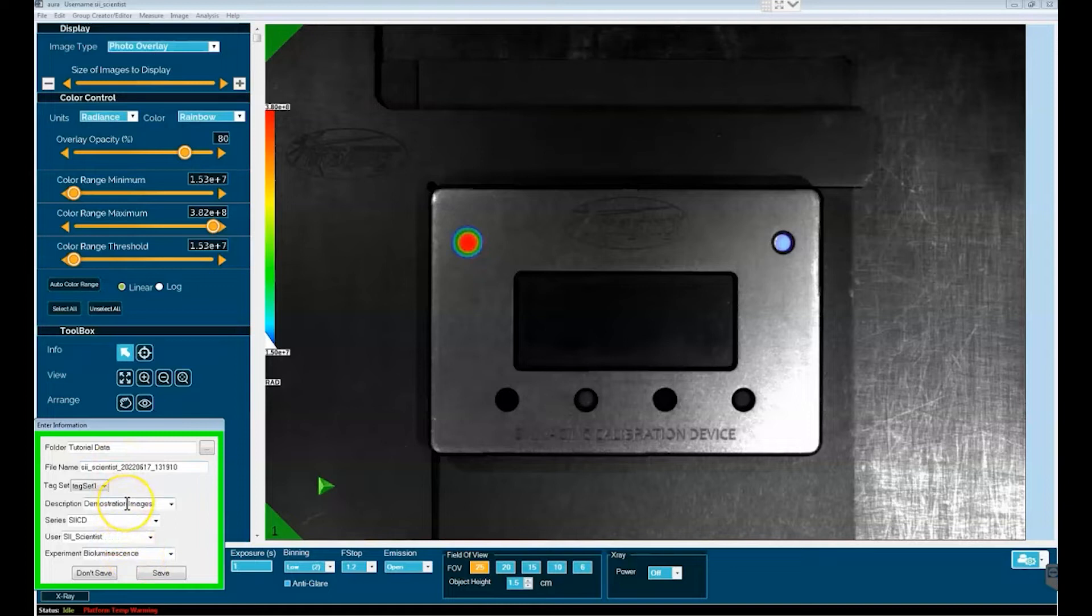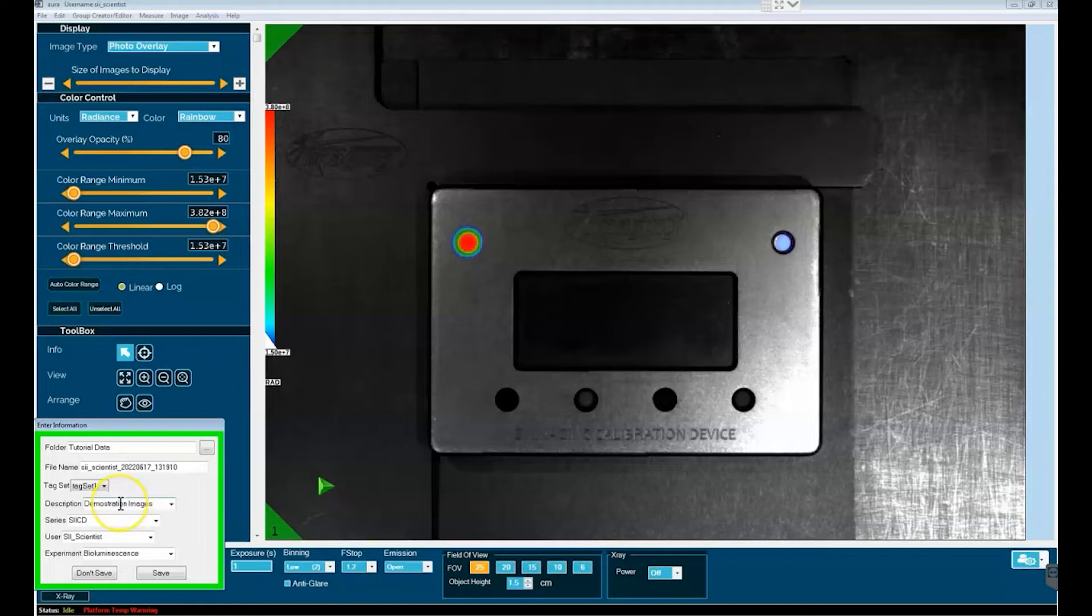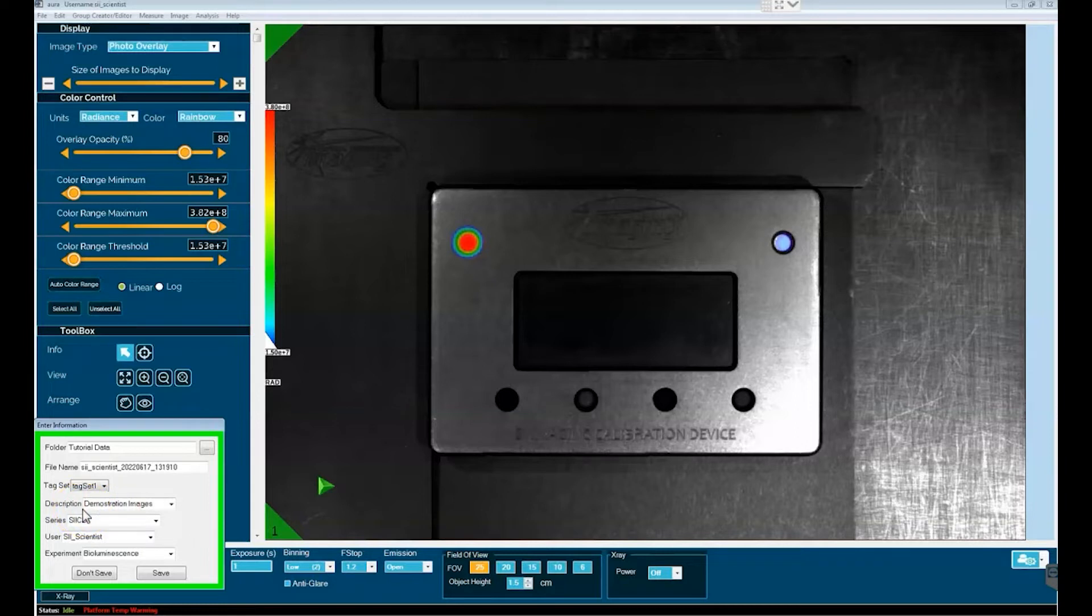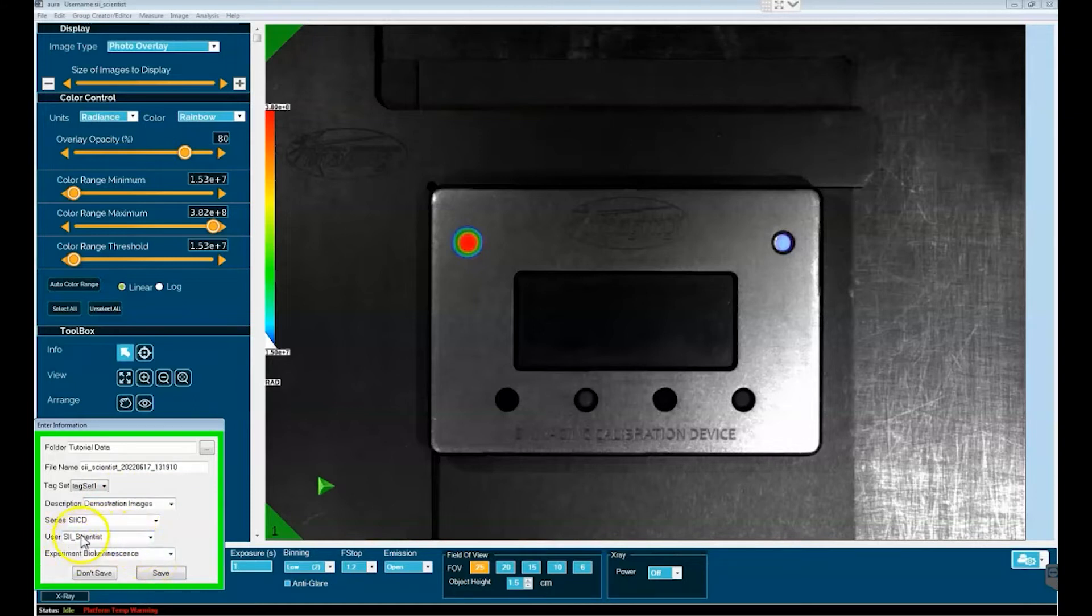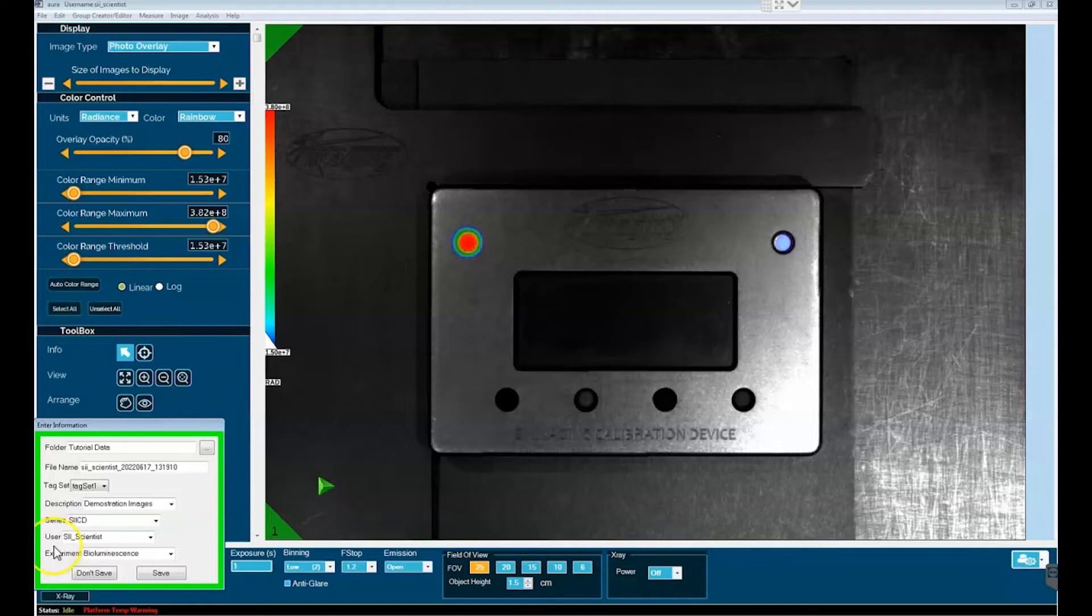You have four different descriptors that can be used as a metadata series to describe what the image that you've taken is, and you can use whatever system you want to populate these four windows. What I've done is from most general to most specific, and you can see that the third window here designates who the user is.